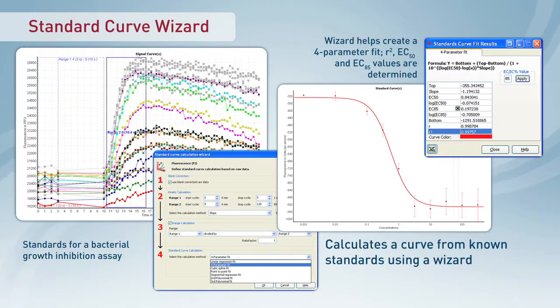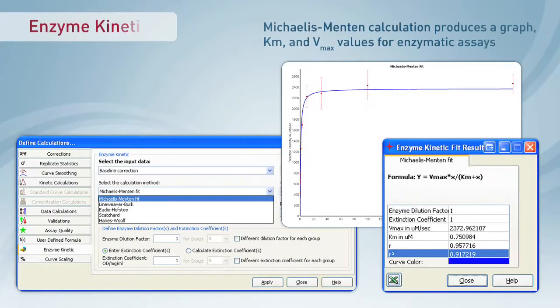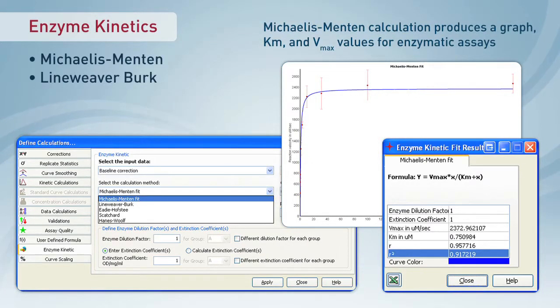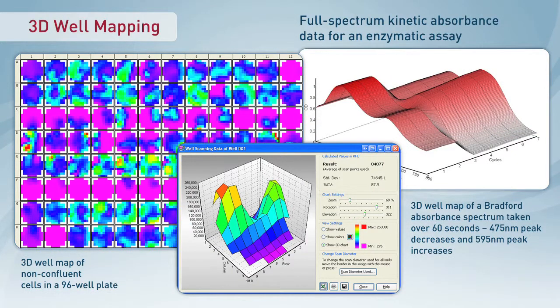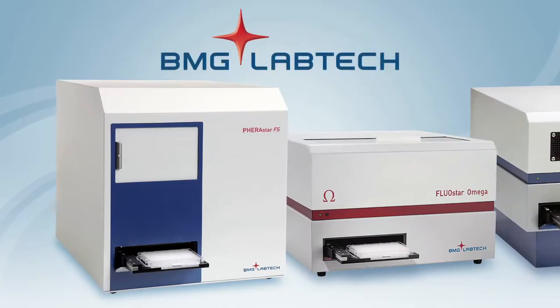Using predefined protocols, a simple template manager makes powerful data analysis easy. Improved robotic integration capabilities, digital signature, and FDA 21 CFR Part 11 compliance means the software works as well for automated labs as it does for new users with one sample.